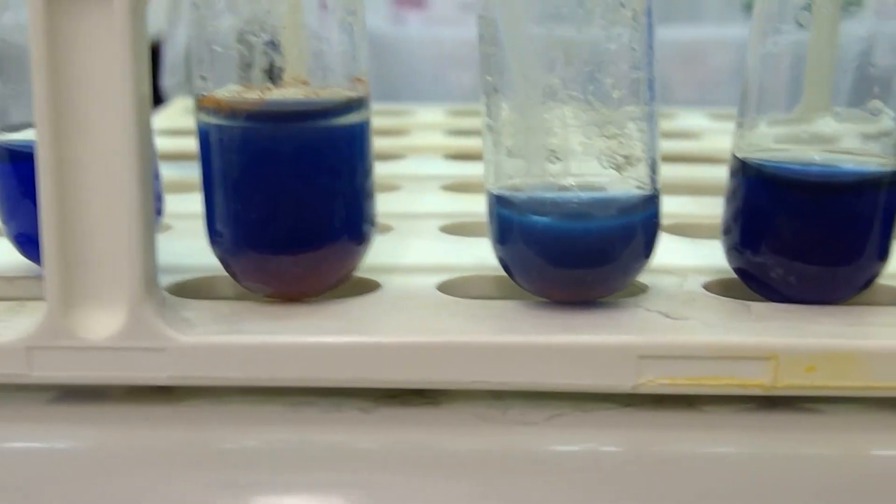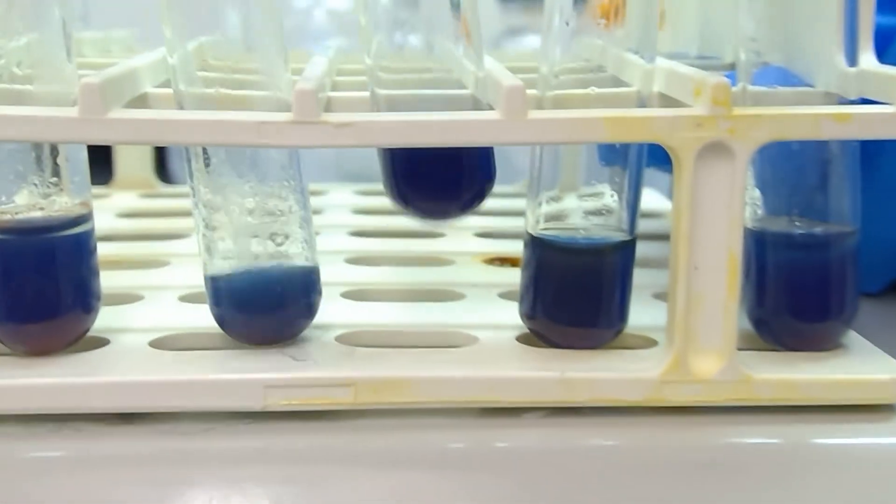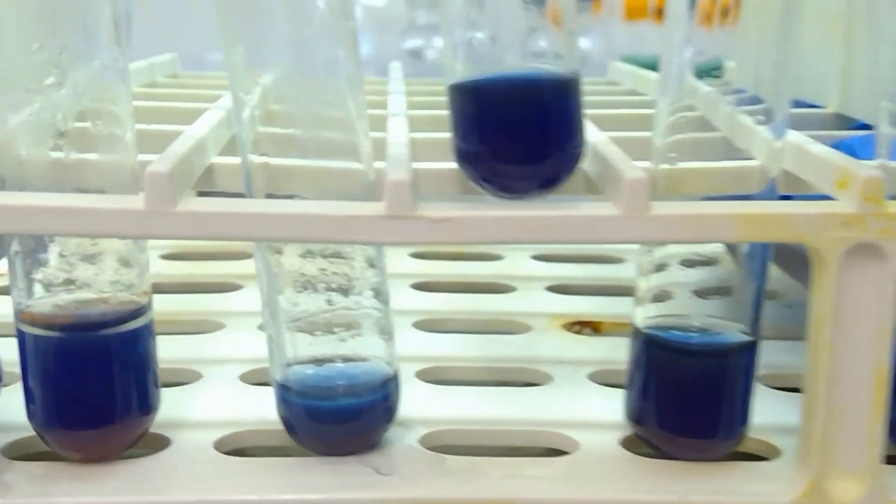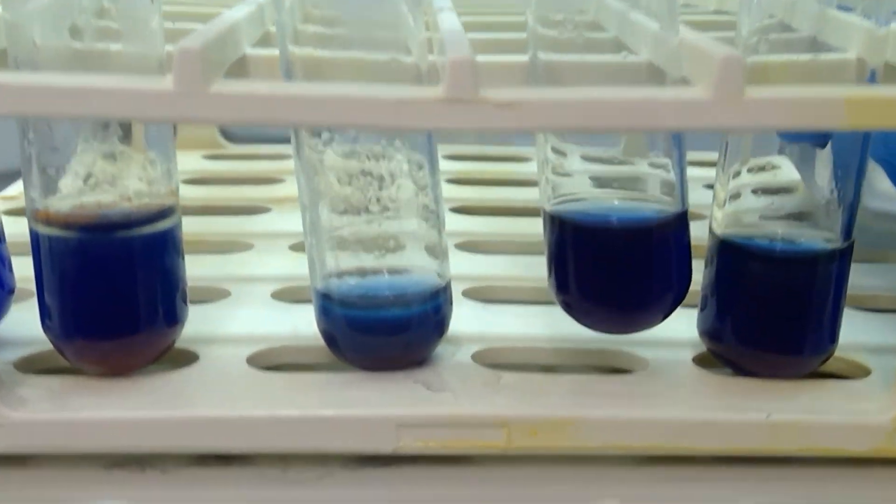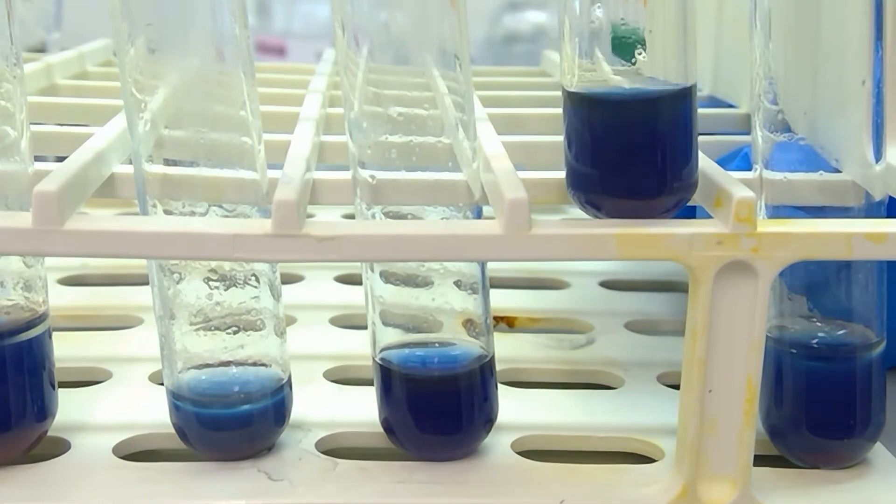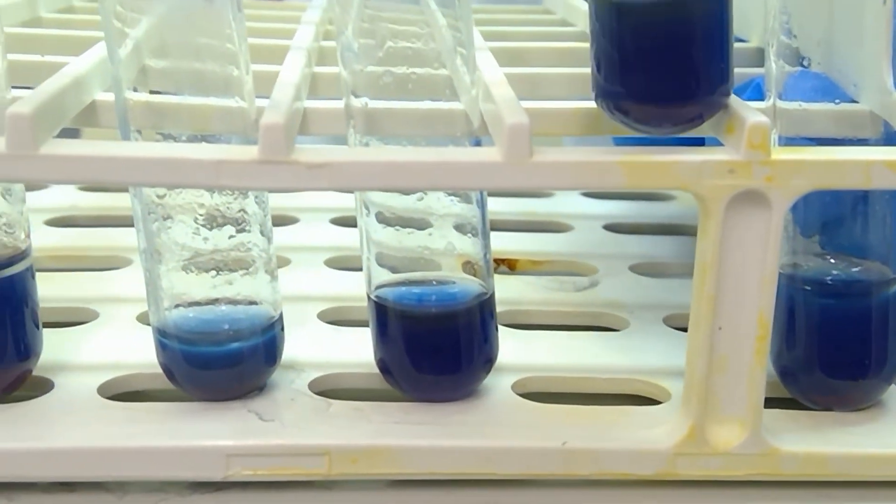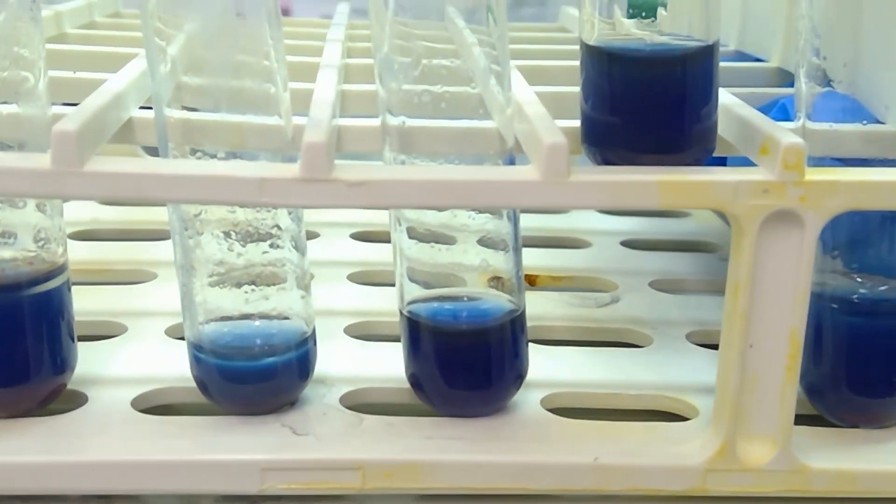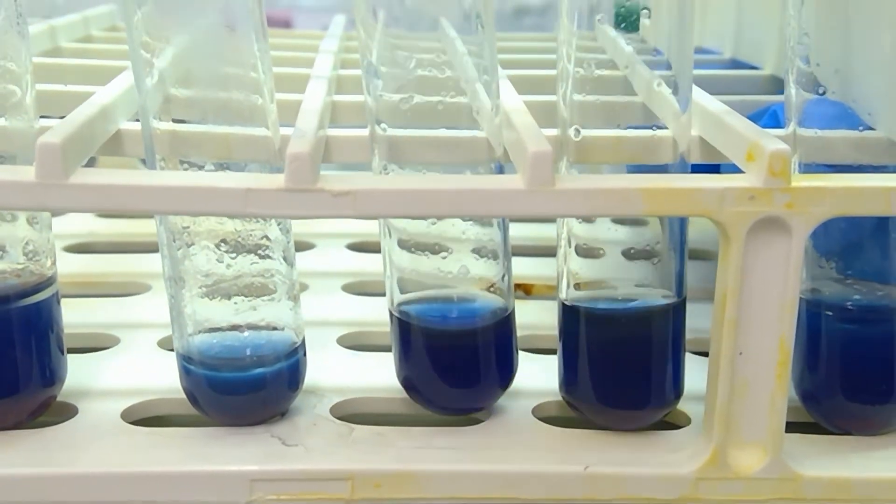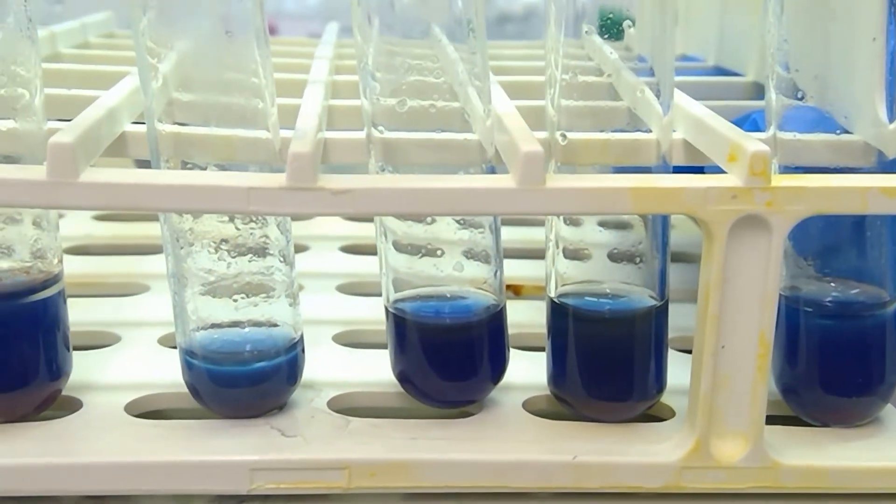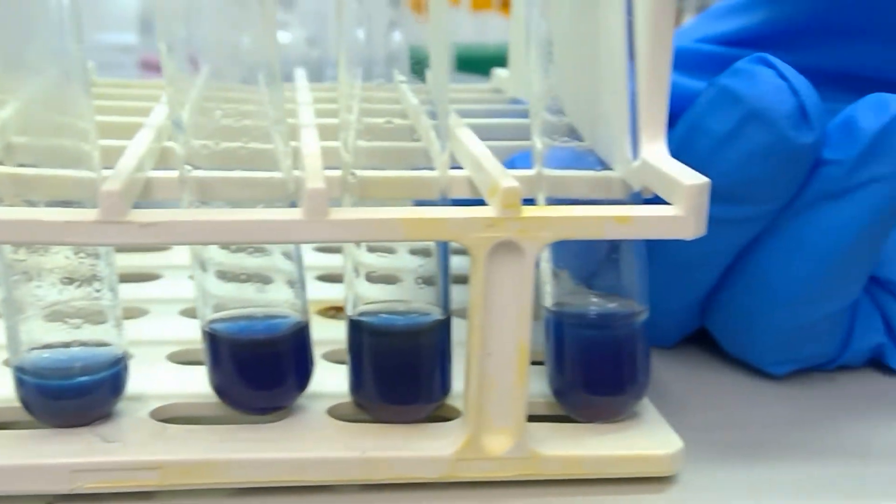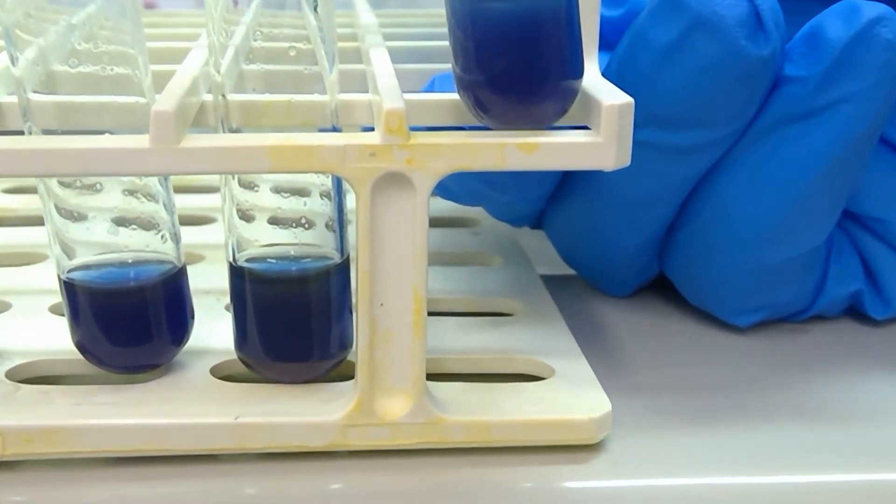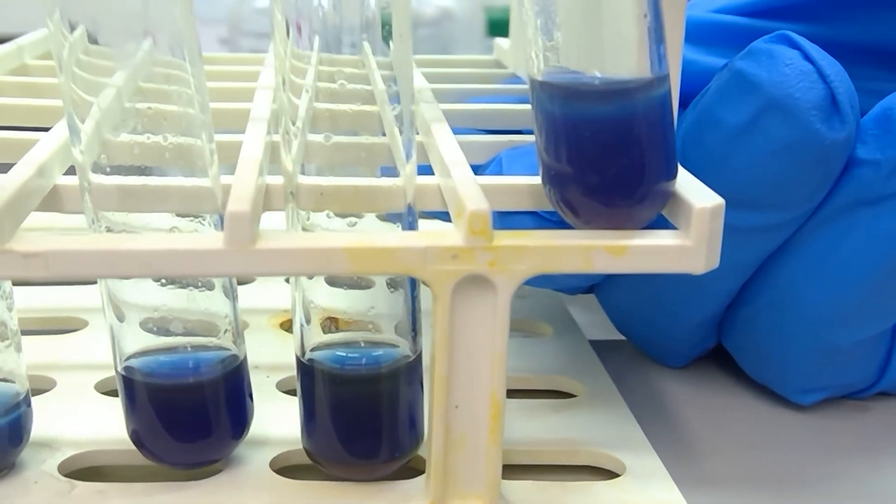Our next sample is 3-pentanone, which is a ketone, and again we got a darker color but no red precipitate that is noticeable. Next up we have 2-propanol. 2-propanol is a secondary alcohol and we didn't expect anything to occur for this particular sample, although it did get a little bit darker in the reaction.